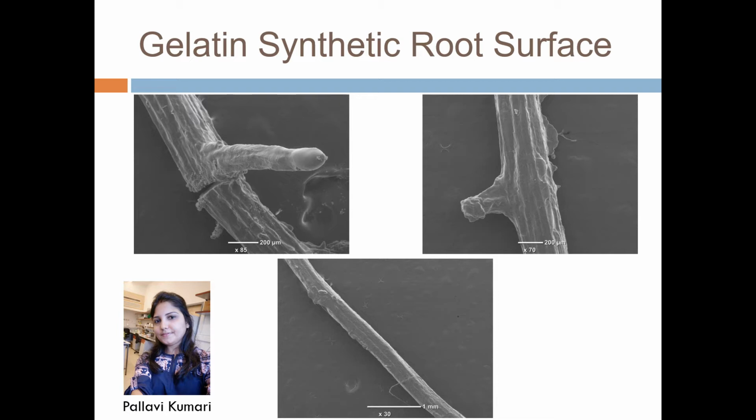So this is not perfect yet, but these are the negative replicas that Paravi got, which you can see are much clearer and better, and we can actually also get the hairs in the negative. The positive still isn't working that well. Again, we can see a very good cell structure, but we still can't get the hairs, but we're getting there.